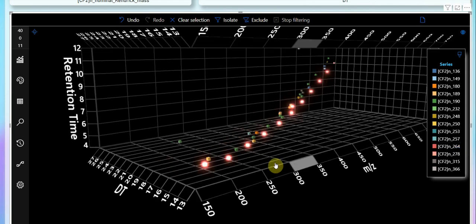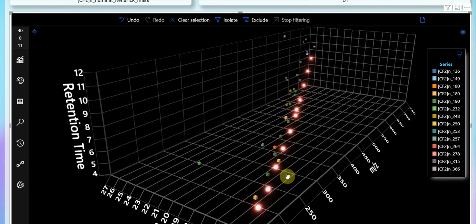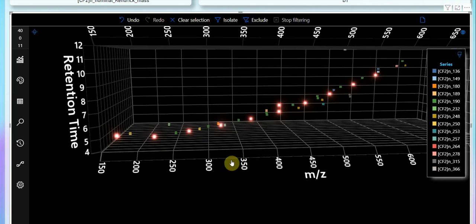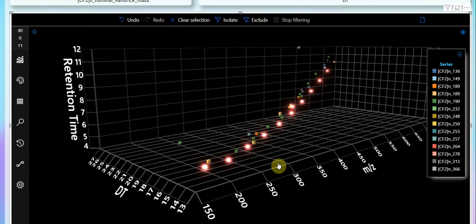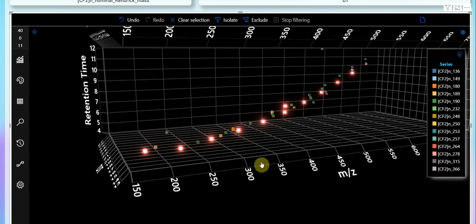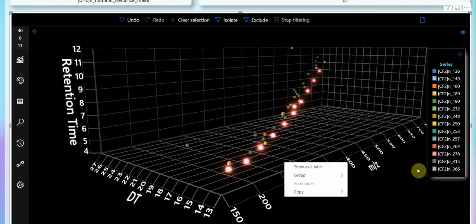And then you can see them highlighted nicely, and you can see the very nice trends for 264 for the PFCAs. And you can see ones that are slightly off trend and try to understand whether they're isomers, and so on and so forth. So, for example, here they share the same mass to charge. Maybe they're isomers. Why the low mass is off, that one may be something you want to look into. So on and so forth.